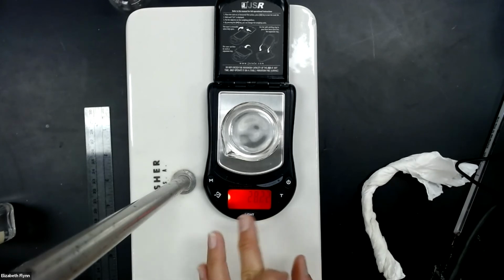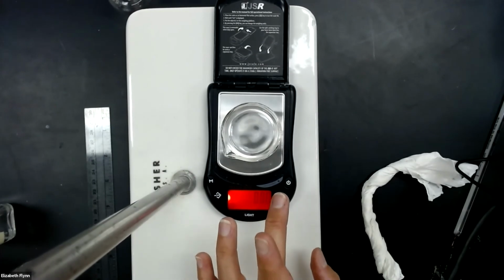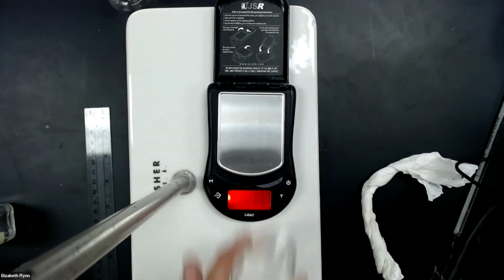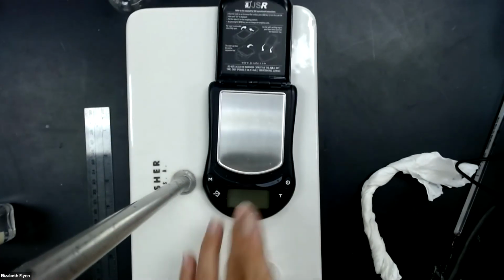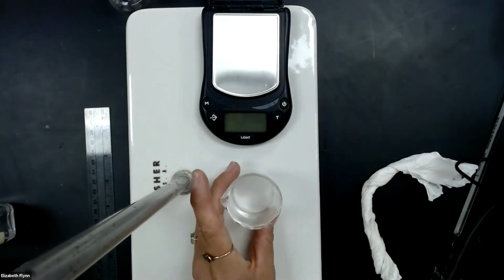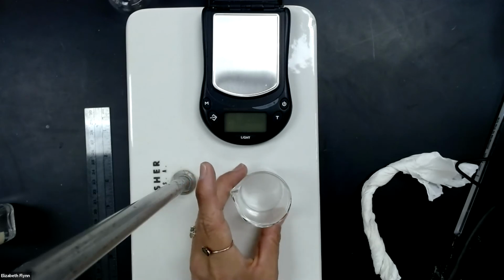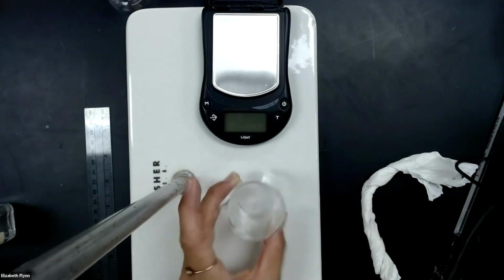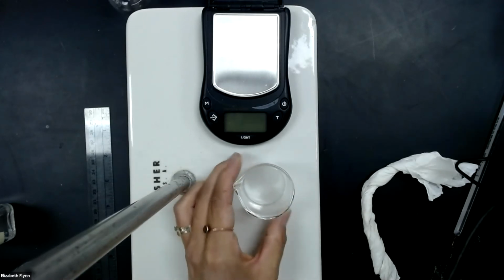So what I think I'm going to do is actually tare this, or we'll just do it this way, actually. I'm going to turn it off. I'm going to add my 30 drops of water so that the balance doesn't turn off, because sometimes the balances turn off in the middle of weighing and it can be frustrating. So instead, I've already got my mass of my empty beaker. Now I'm going to add my 30 drops of water.